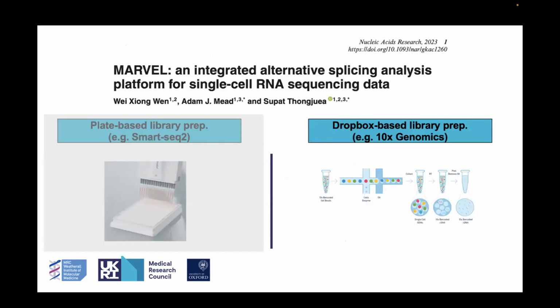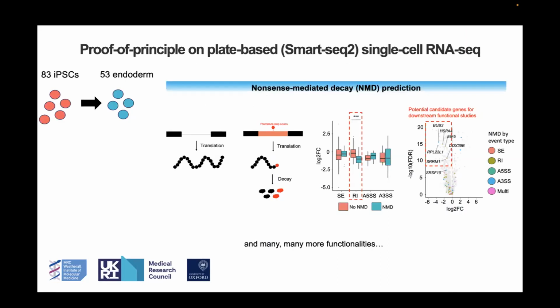Hey, Shin, we have a question on the chat. Okay. So Krishna asks if there is a correction in the analysis to understand the effect of read counts, because one of the issues of single-cell RNA-seq is that low number of RNA numbers can severely distort the splicing effects.